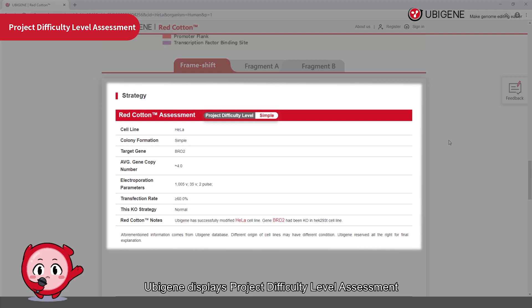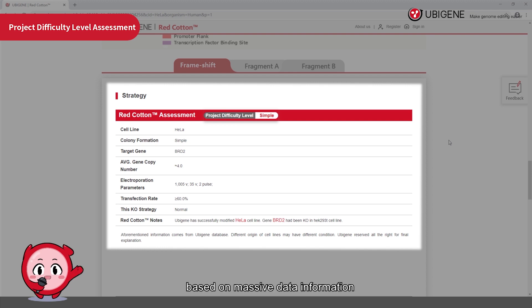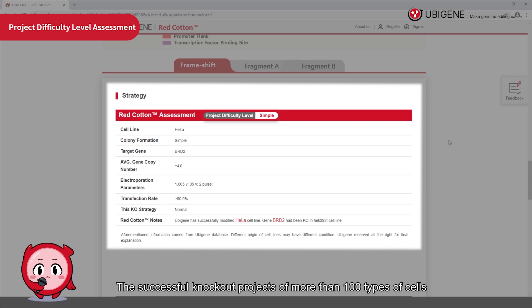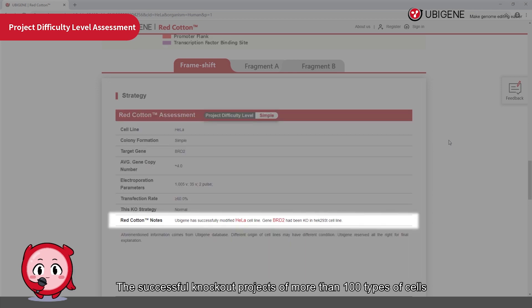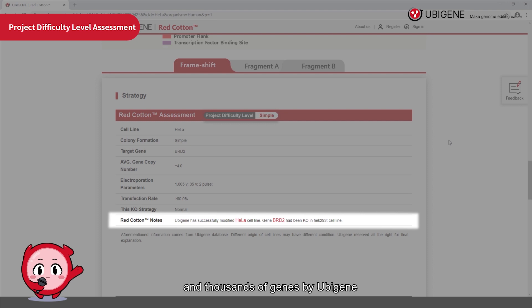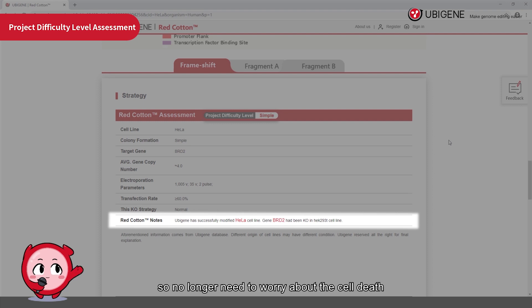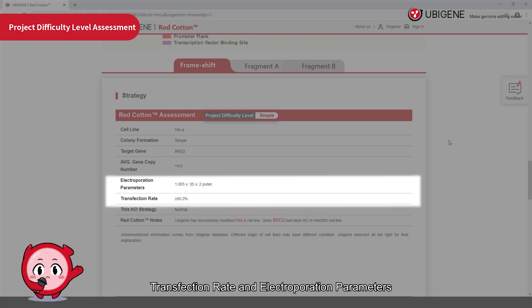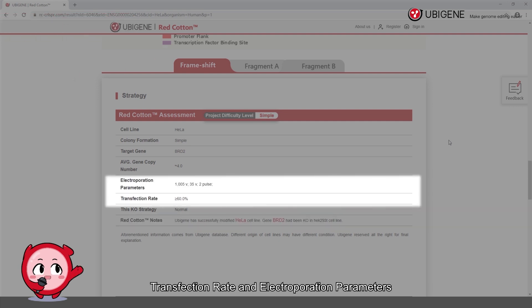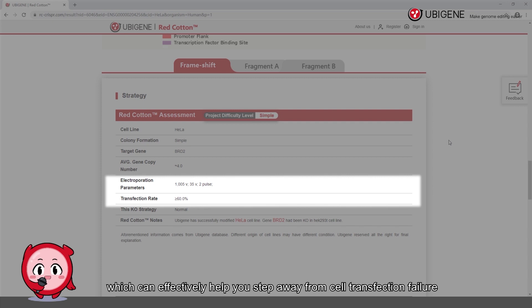UBGene displays project difficulty level assessment based on massive data information, which includes successful knockout projects from more than 100 types of cells and thousands of genes. So you no longer need to worry about cell death or apoptosis caused by gene knockout, transfection rate, or electroporation parameters — which can effectively help you avoid cell transfection failure.